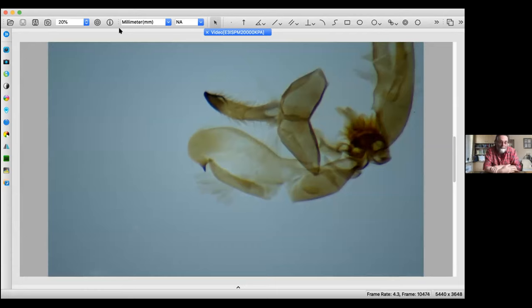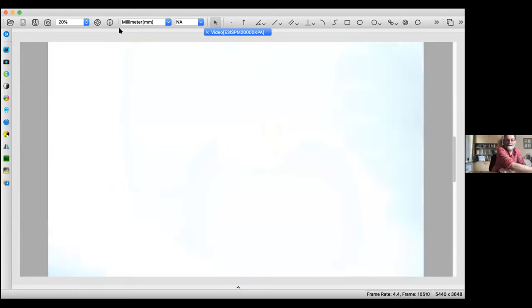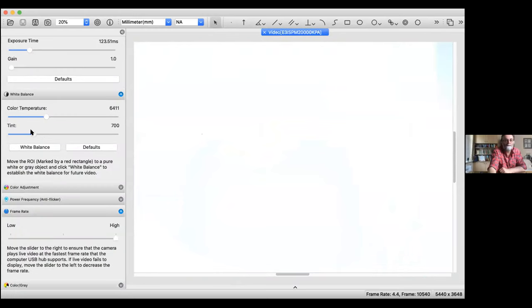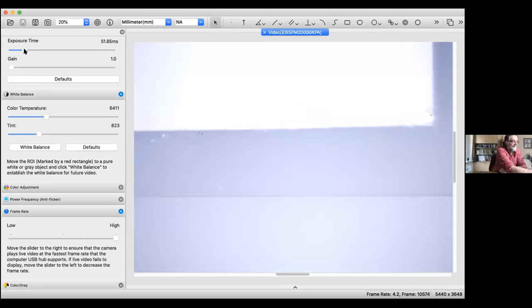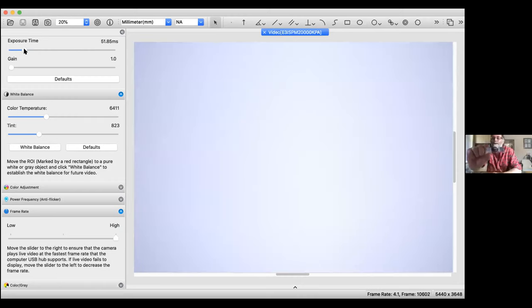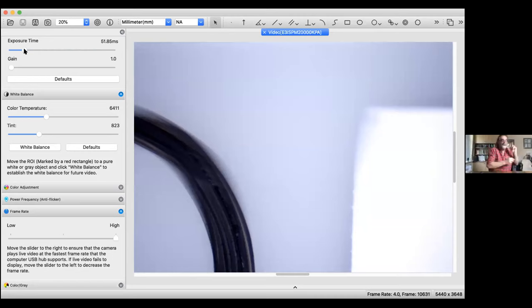After that I either glue the bits back to the card or make a microscope slide. I actually have two labels on the slide. To report the findings to the county recorder, I have yet more labels that get stuck to a sheet, and then we scan that sheet and send it to Adrian. If I've made a permanent slide, I also have a logbook.